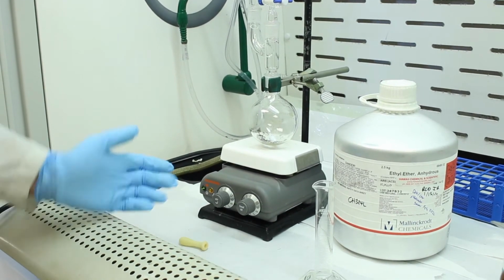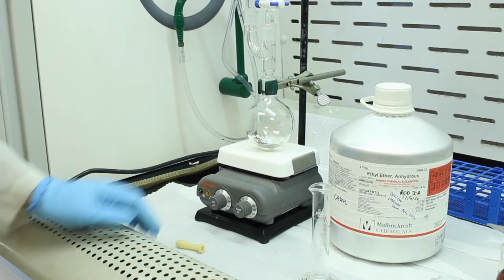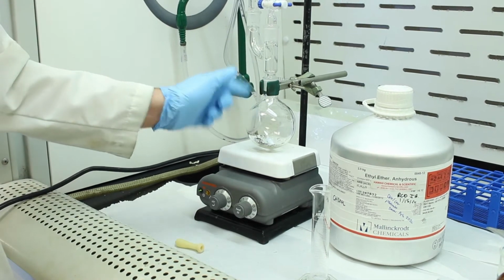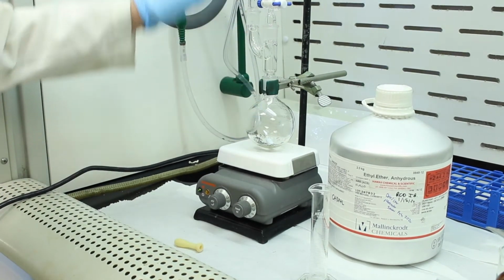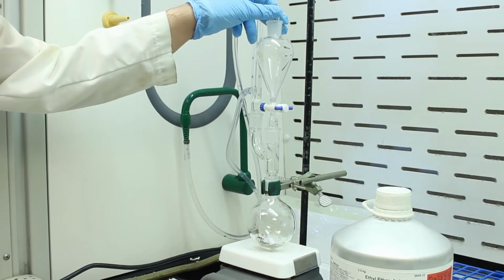It's not protic, so it's not going to react. But it's also anhydrous. Anhydrous is important because you need it to be free of water. Anhydrous means without water. And to add to this flask, we're going to add 10 mils here, and then we're going to add 10 mils to the sep funnel. In fact, I think I'll just add both of them through the sep funnel.